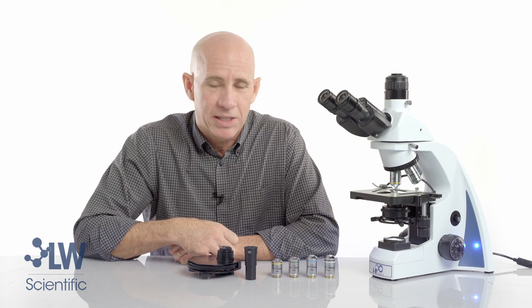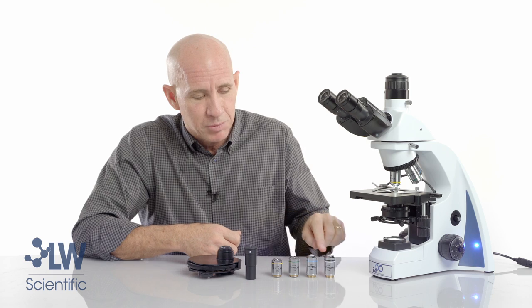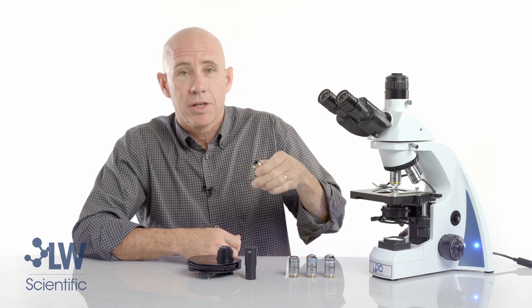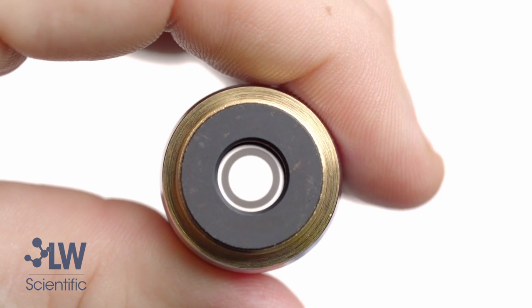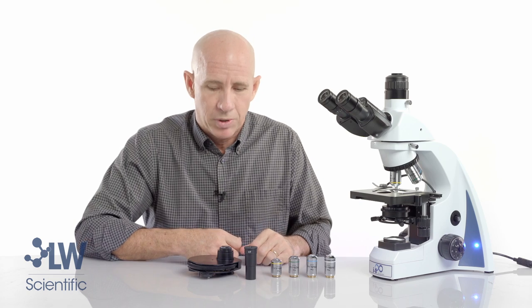Now let's talk about what makes phase contrast objectives different. Each one of these objectives has a dark annulus ring built into it, and if you look closely through the rear of the objective you can see the dark ring, which I often call the dark donut. This will become important later in the alignment process.